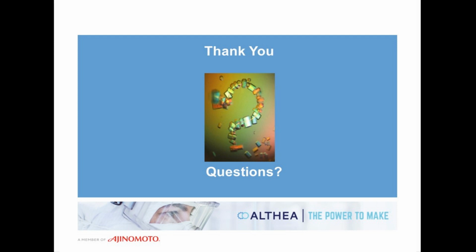However, what we're implementing now, fairly recently, is the statistical analysis program called JMP, as well as MATLAB. Utilizing both of these softwares, we're able to write code to pull out and mine the data for us. MATLAB will pull out, mine the data, and get it all organized, and then JMP we can utilize to create the graphs and put it into a visual format so we can make our decisions that way.